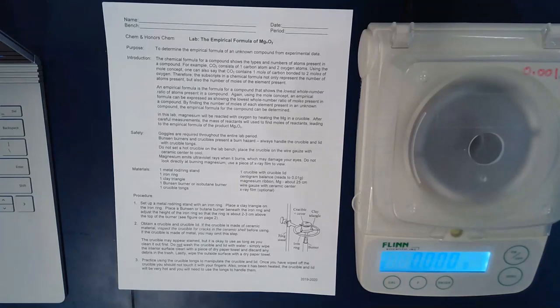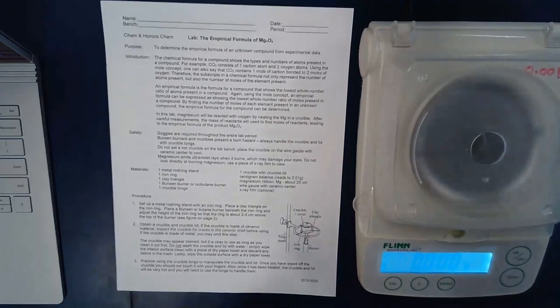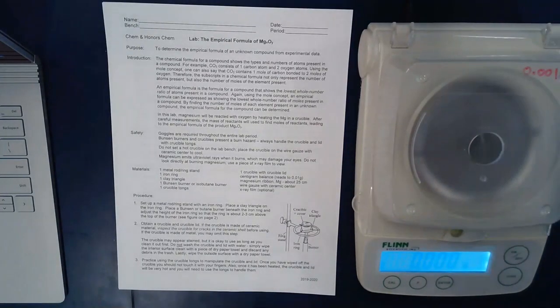Mr. McGinnis. All right, today, men, we're going to work as lab partners to do a lab on empirical formulas, and we're going to collect some data so that you'll be able to figure out the empirical formula of the product between magnesium and oxygen.